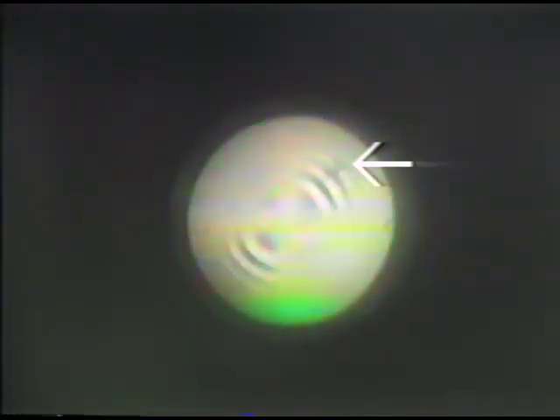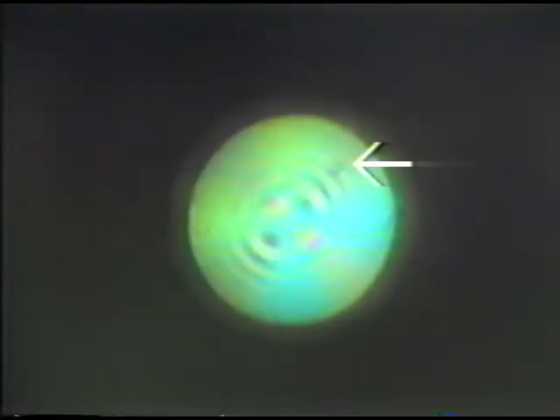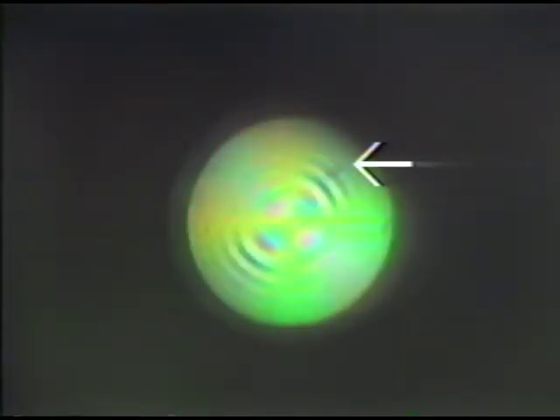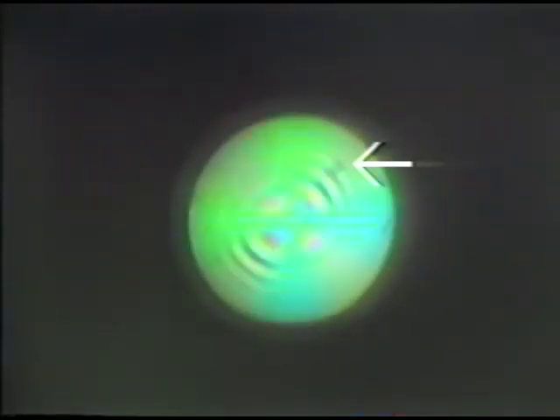And you can see that as I insert the wedge, as I'm doing now, the colors move away from the center of the northeast quadrant. That is, the color curves expand. The color curves expand in the northeast quadrant, they contract in the northwest quadrant. So now I'm inserting the quartz wedge, and you can see the expansion of colors in the northeast quadrant and the contraction in the northwest.